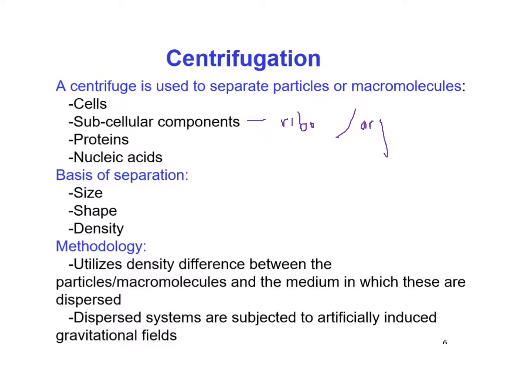Organelles. Wow, look at that, organelles. And I can't spell, but that's okay. You get the message. That's an O there. And ribosomes. These are dense particles here.